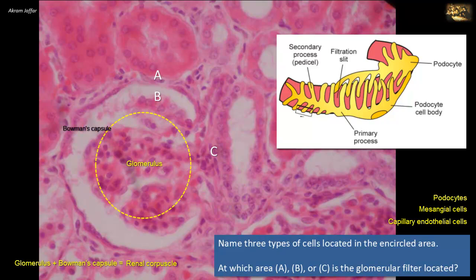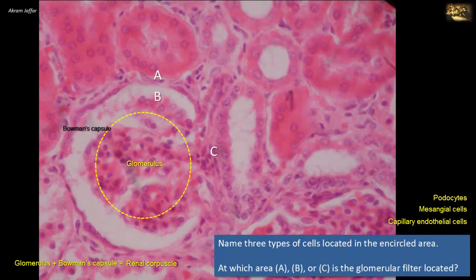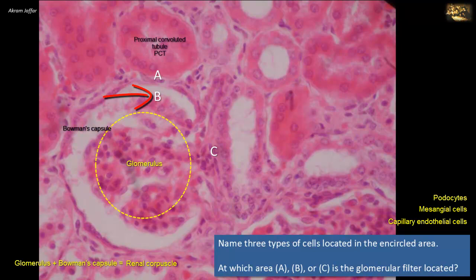Plasma from the glomerular capillaries filtrates into Bowman's space through the capillary endothelium, capillary basement membrane, and the slit pores of the podocytes. Thus the filter is located where the capillary tuft of the glomerulus borders the Bowman's capsule — at location B. To exclude the other options: A is the border between a proximal convoluted tubule and the parietal layer of the Bowman's capsule. C is where the juxtaglomerular apparatus is located, between an afferent arteriole of the glomerulus and the distal convoluted tubule.